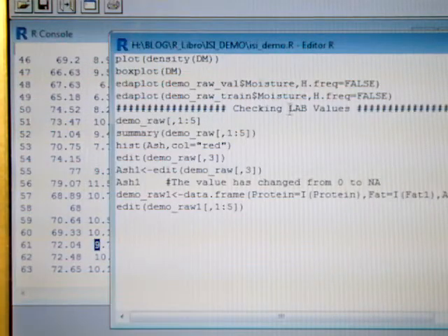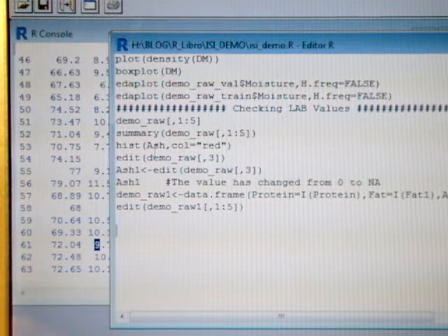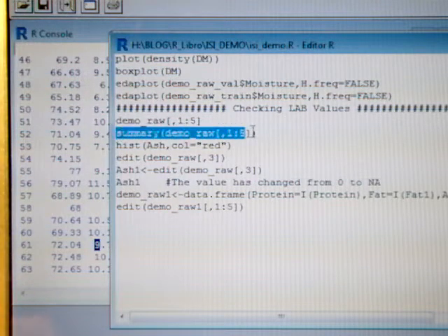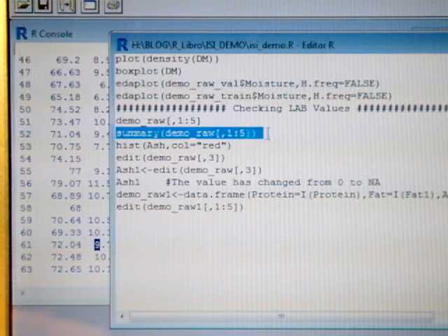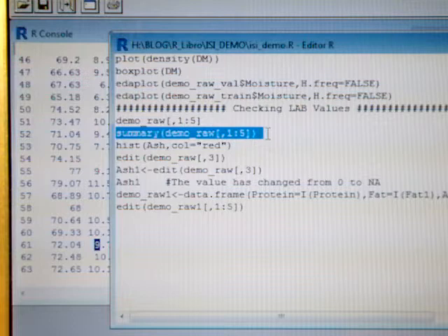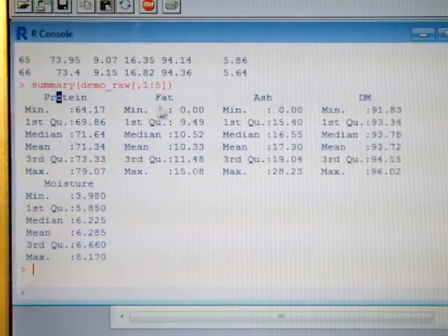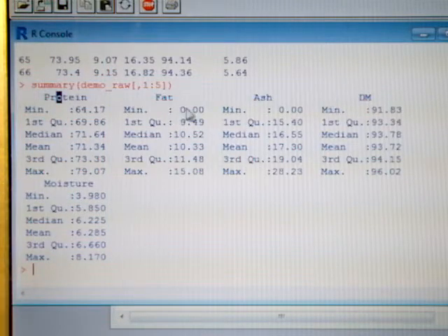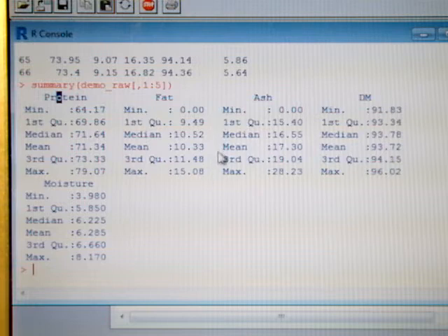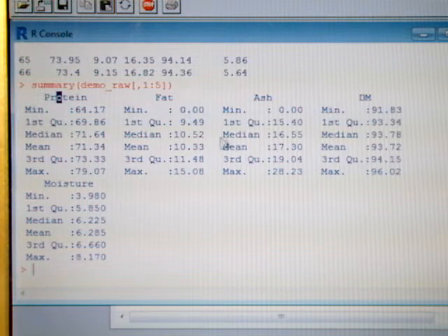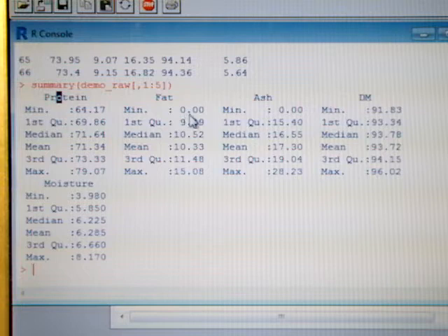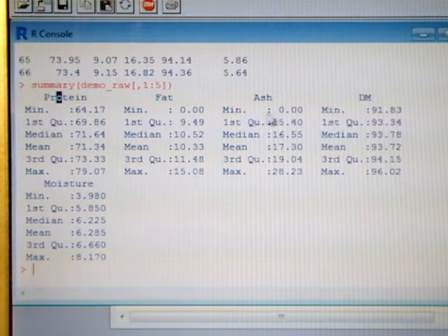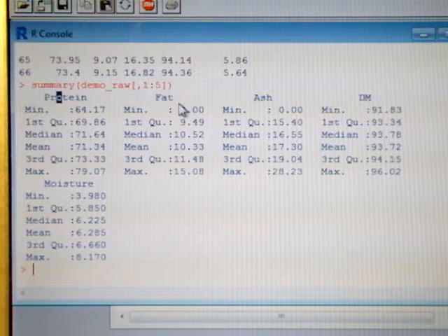If you have a big data set, maybe it is better to run the summary, and you can have a look to the minimum and maximum, mean and so on, in order to check that we don't have strange values like in this case 0 for the minimum for ash and fat.